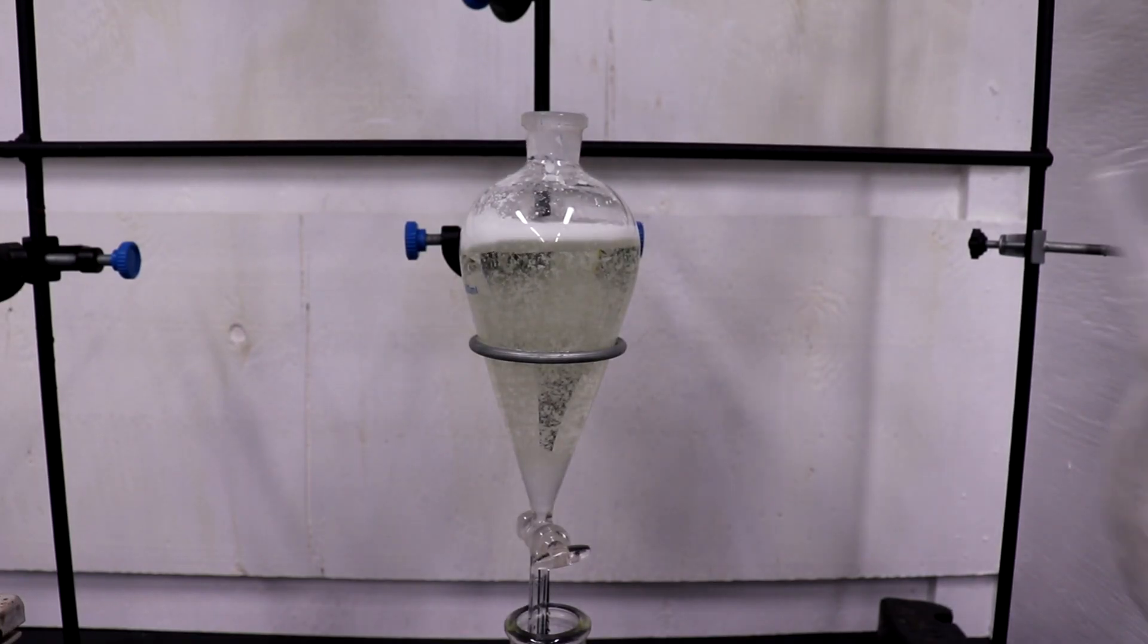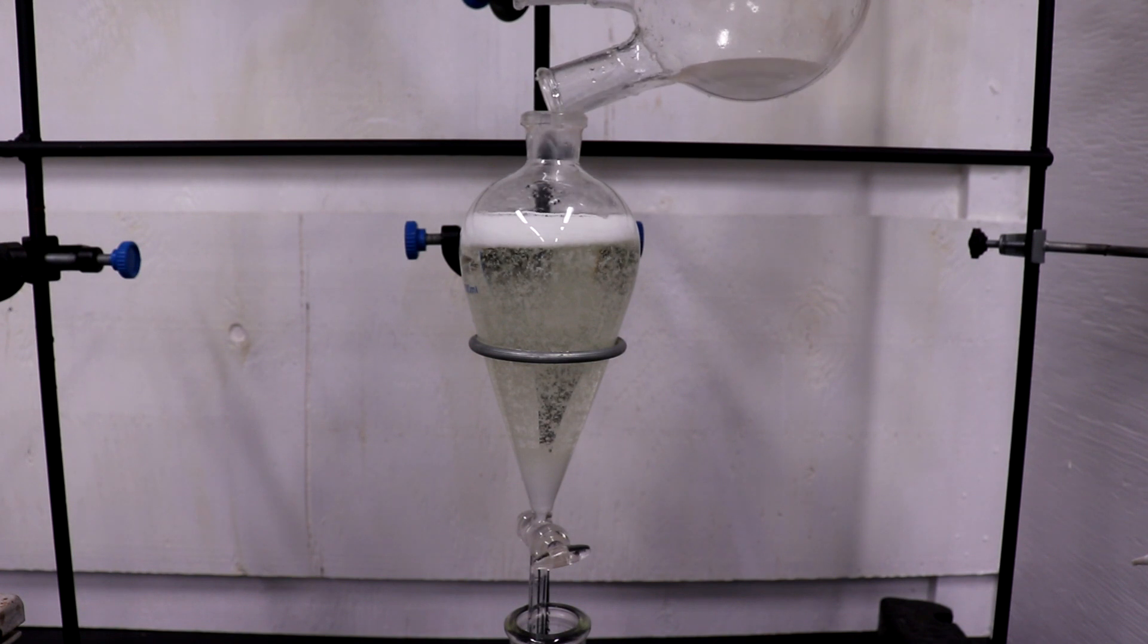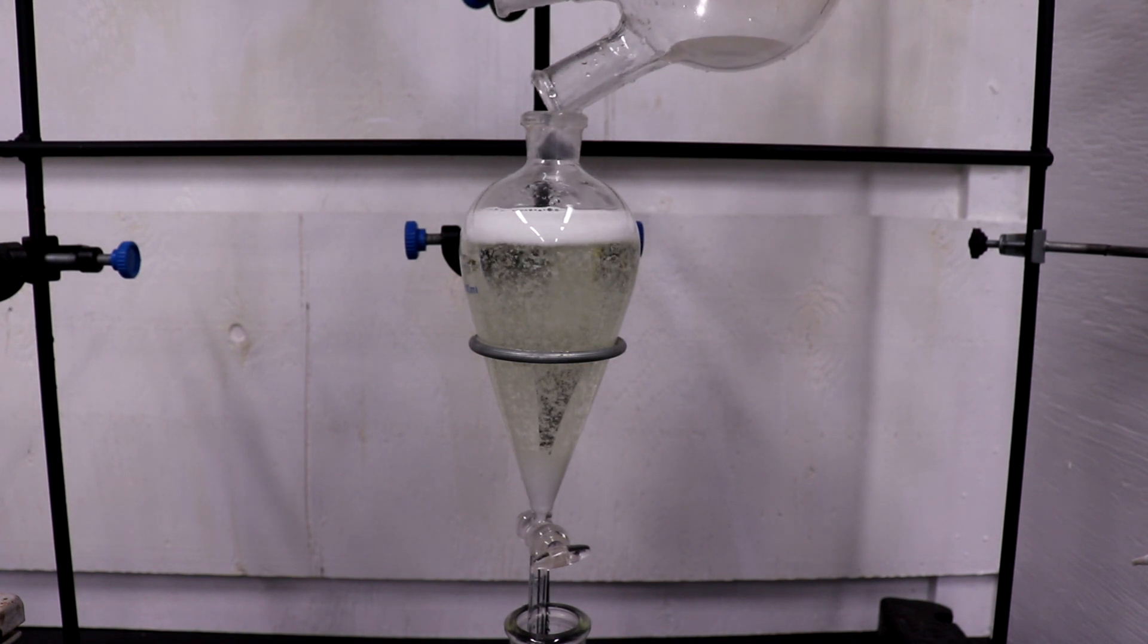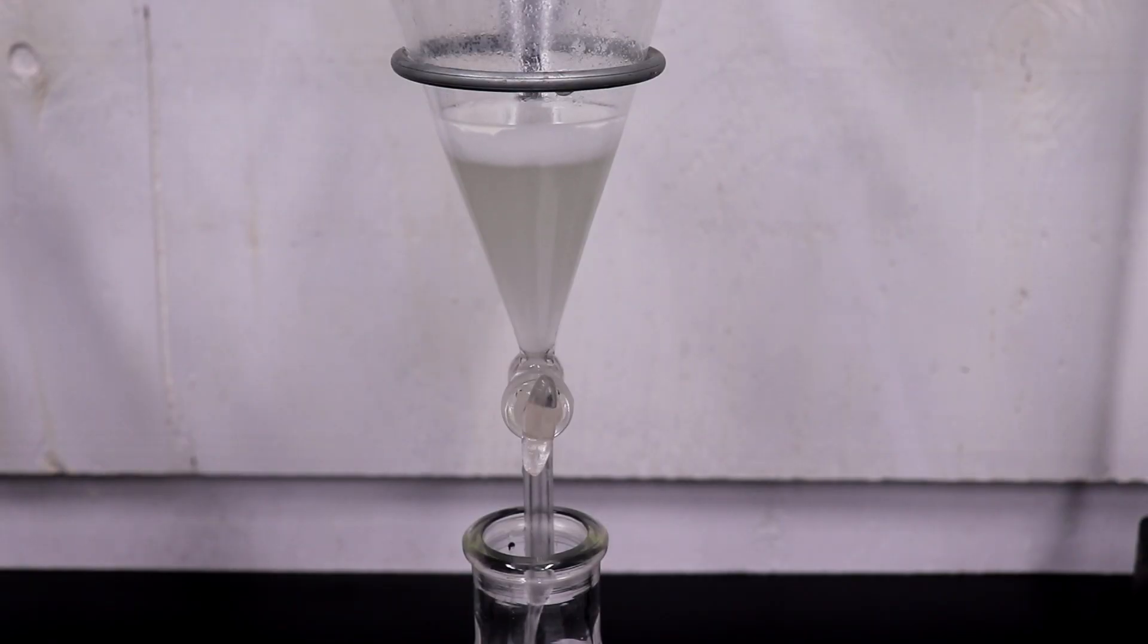The mixture was then extracted with 50 mils of ether and washed with 4 20-milliliter portions of ether. You can see some undissolved product in the ether layer, and to remedy that, you can just add some more ether to fully dissolve the product.